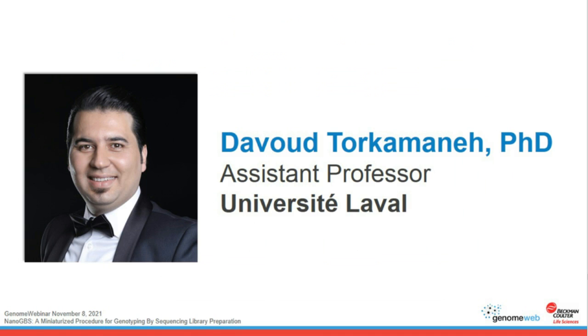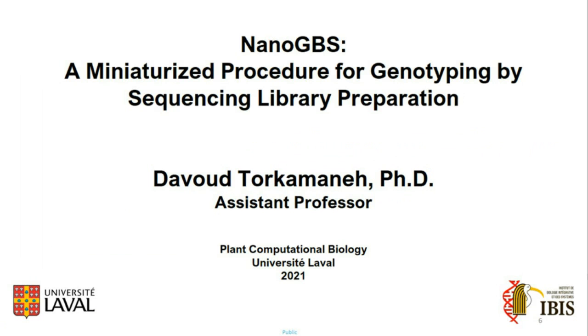And with that, I'll hand it over to Dr. Torkamaneh. Please go ahead. Thank you, Kirsty, and I'm happy to be here with you. Today, as Kirsty said, I'm going to talk to you about NanoGBS, a miniaturized procedure for genotyping by sequencing library preparation.